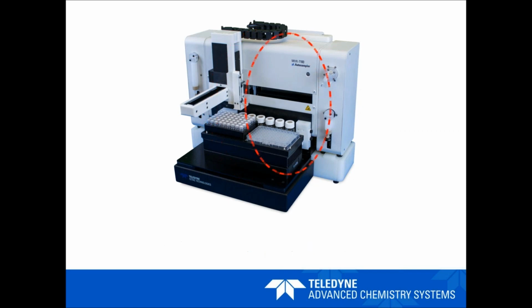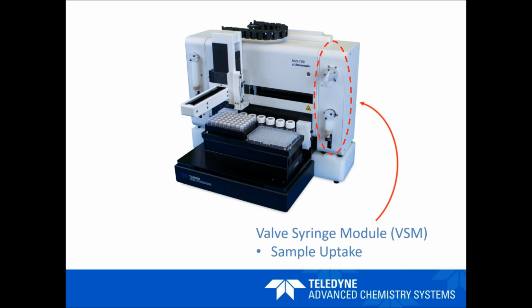On either side of the automation, you've got some additional modules. In this case, we've got one on the left and one on the right. They could be either way round, depending on the kind of ICP-MS that you're working with, or you could have them both on one side or the other if you chose. In this case, I'm going to start with one of the modules here. This is the valve syringe module.